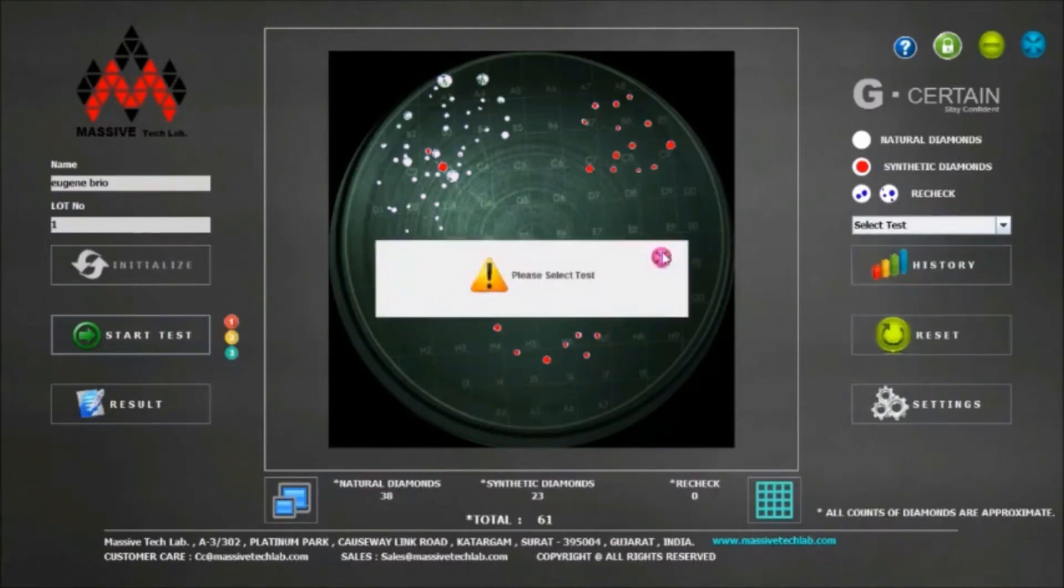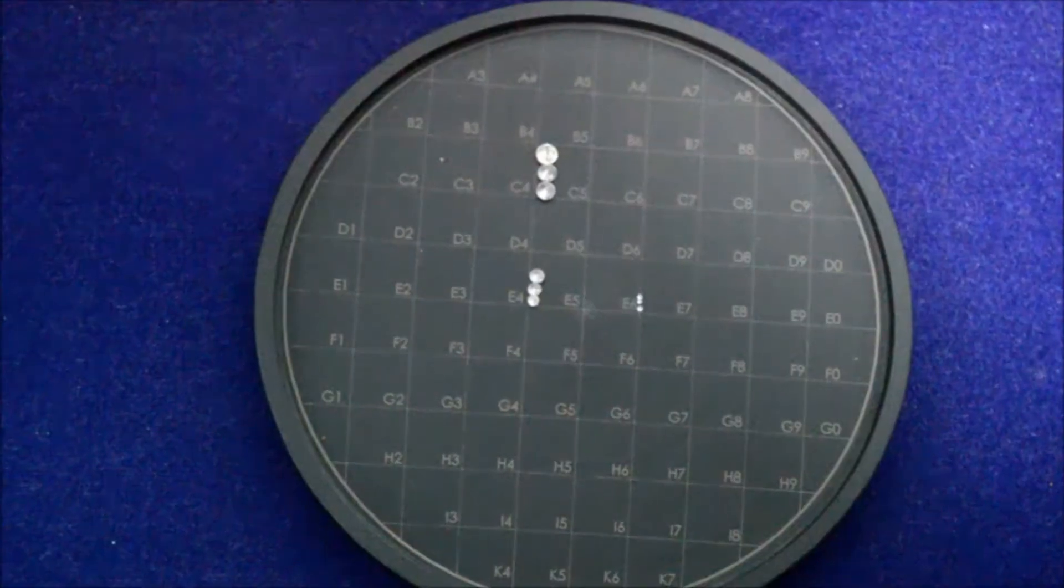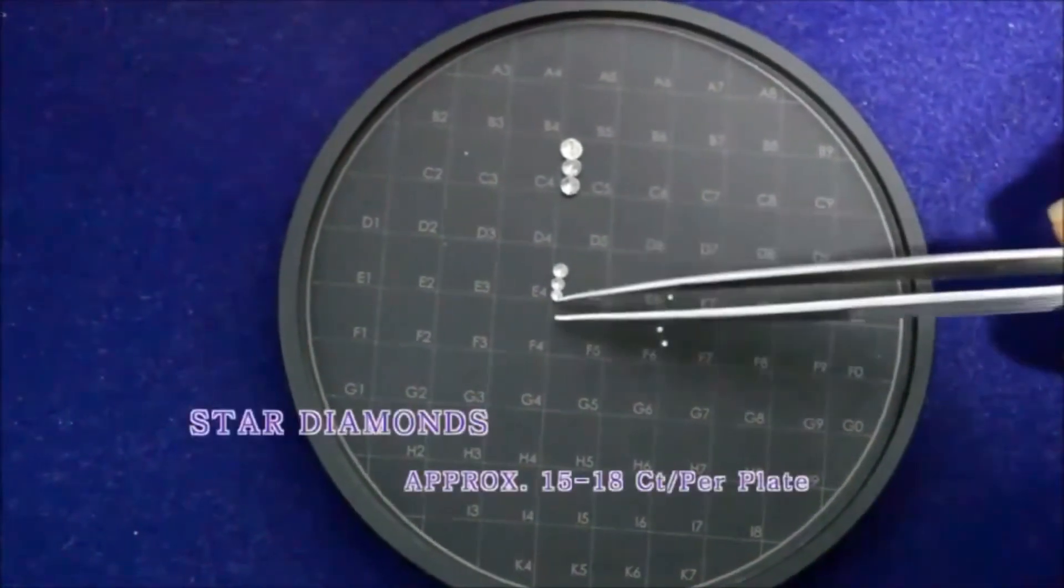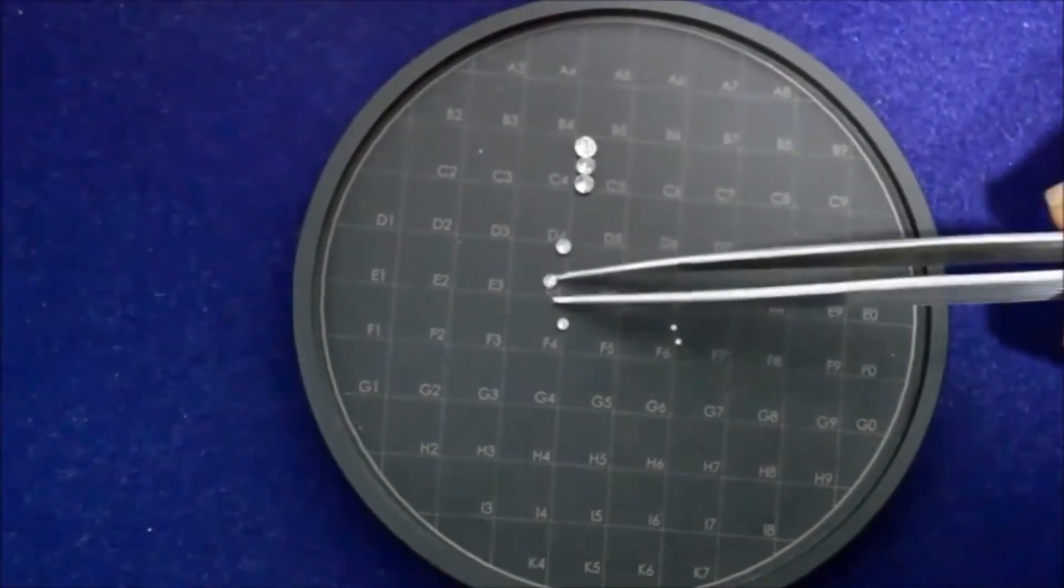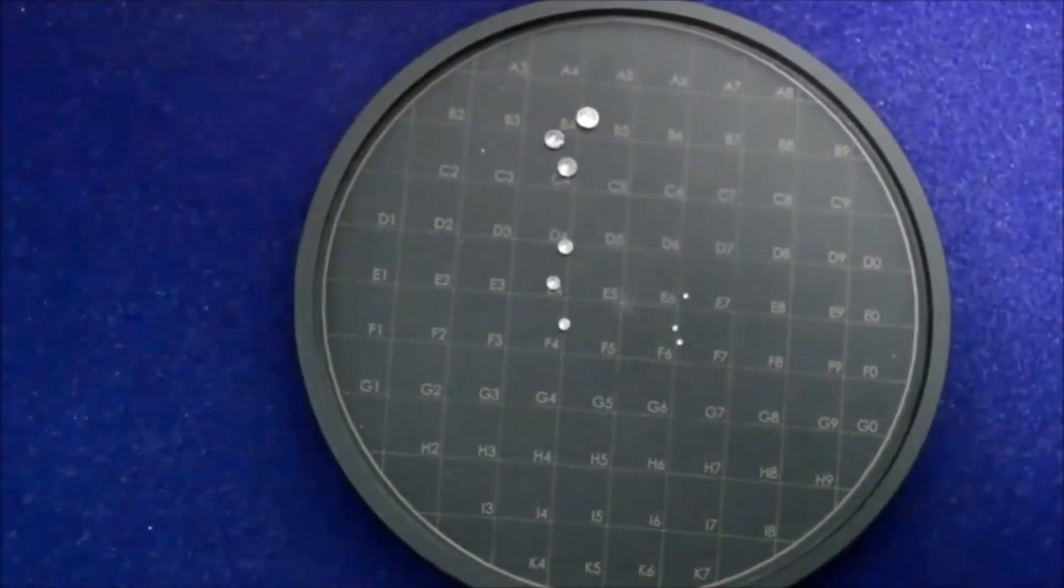We can use reset button to reset testing between and reset test parameters. G Certain is capable of loading diamonds 7 to 8 carat of 1 millimeter size, 5 to 18 carat of star size, and 30 to 35 carats of melee size. This is G Certain.